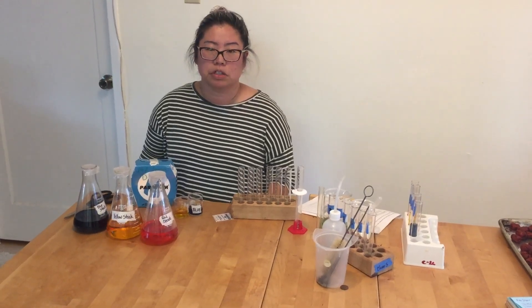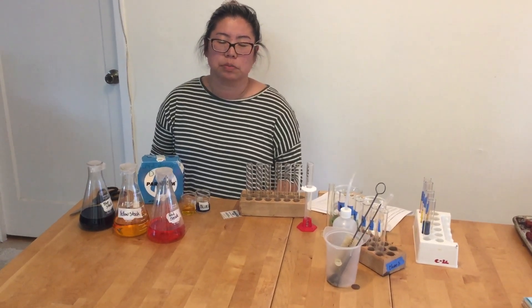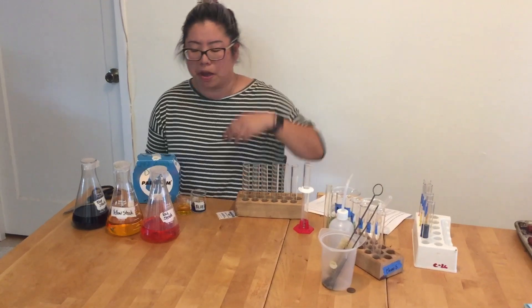Hi, welcome to Ms. Chow's pre-lab. We are doing the pre-lab for the precise volume lab.